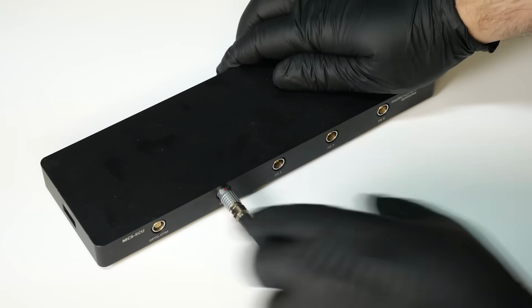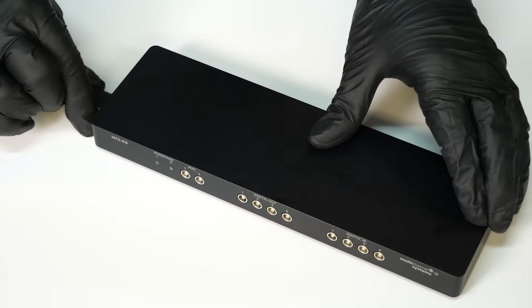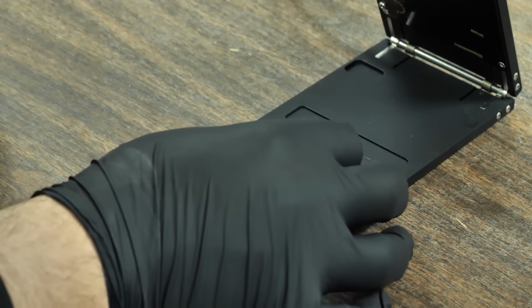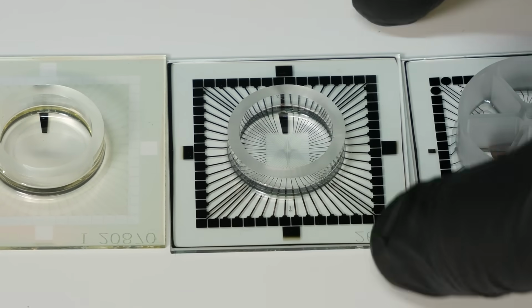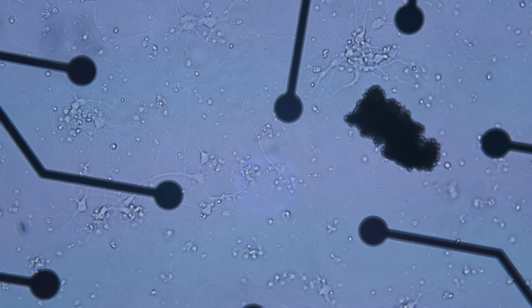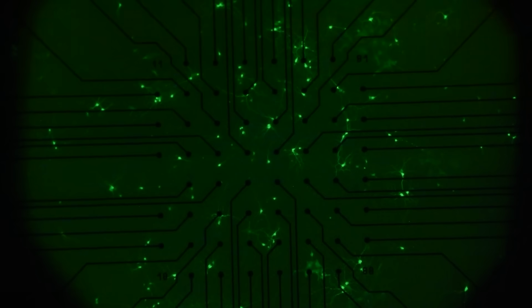We went over the setup of the system in detail last time, but here's the TLDR. The system connects together in 3 pieces and connects to my laptop via USB cable. The head stage is this clamshell piece, and it's where you put multi-electrode arrays with your cells on it. Multi-Channel Systems also was kind enough to send us a few of their incredible electrode arrays. Since these are meant for recording human neurons, the electrodes are all incredibly tiny and are clustered into a small area for maximum neuron resolution.